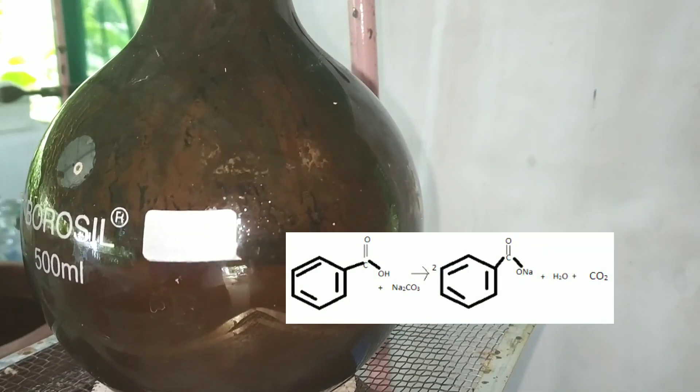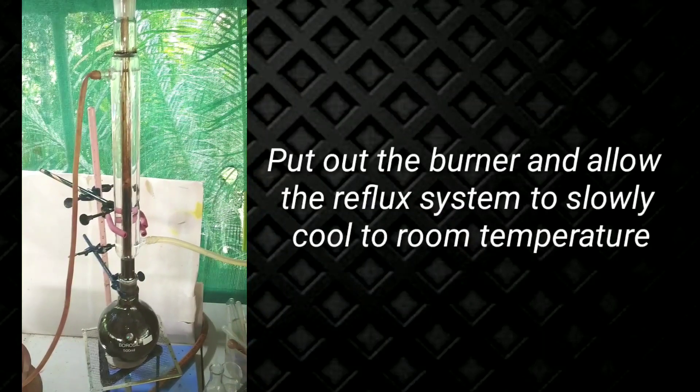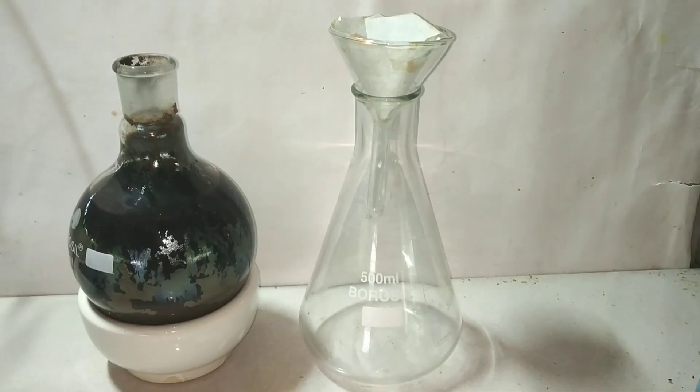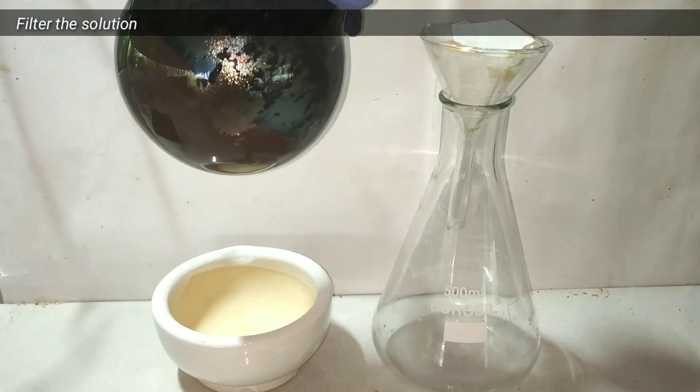Keep adding the potassium permanganate solution in small lots. We want all of the benzaldehyde to oxidize and form benzoic acid, and some excess potassium permanganate should remain in the solution so that we can confirm the reaction is complete.